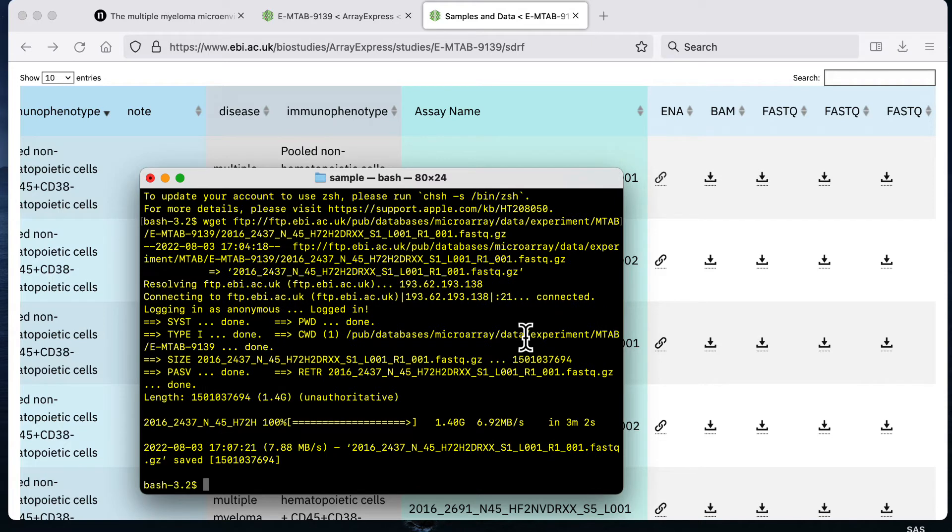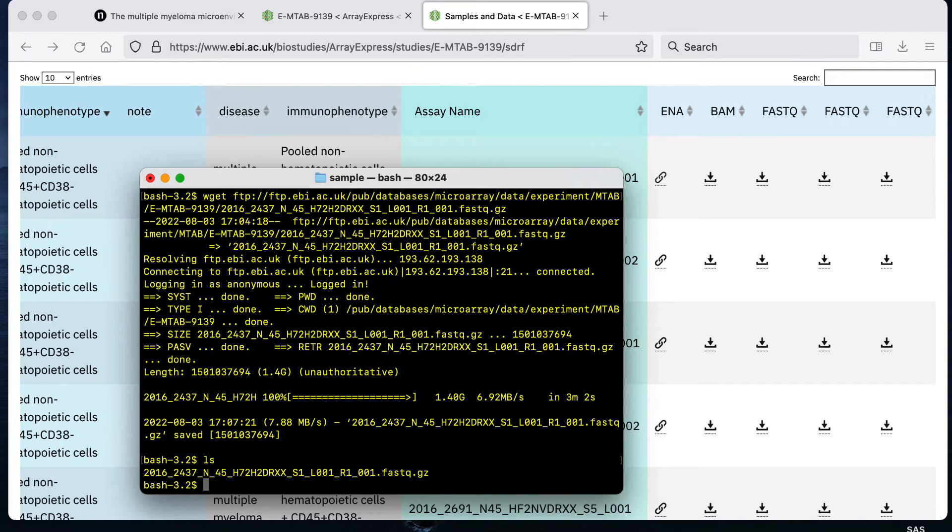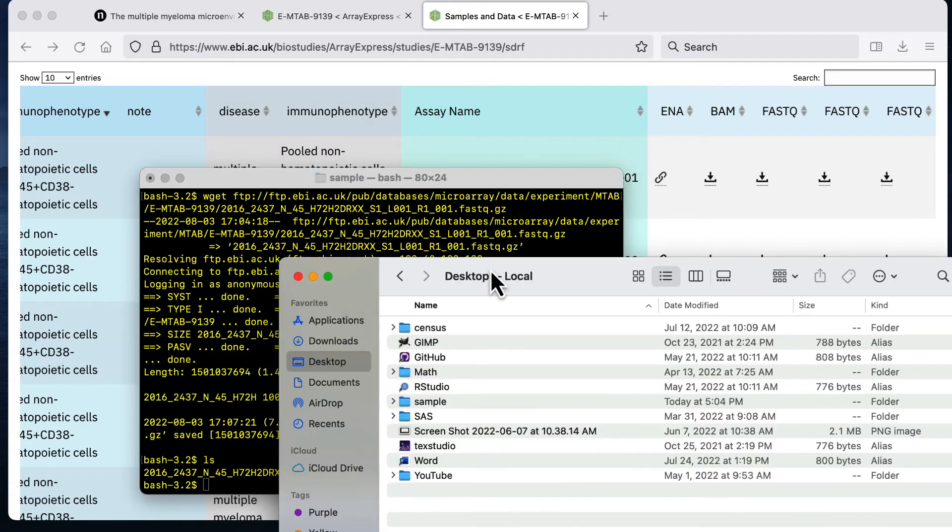That took about three minutes to finish running and then when it's done I'm just going to check again what the contents of my folder is with ls and we see that now we have one file downloaded into that folder.